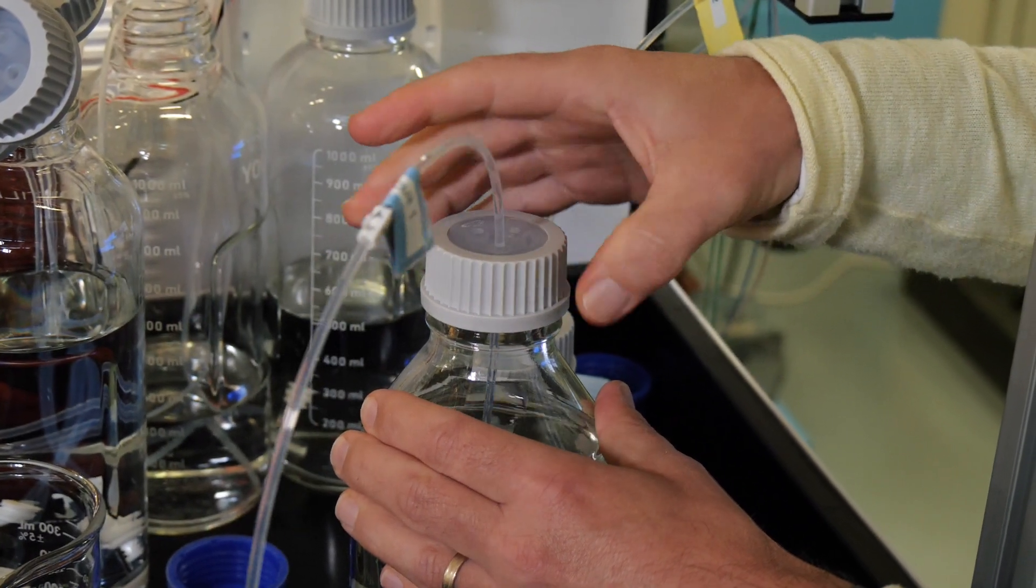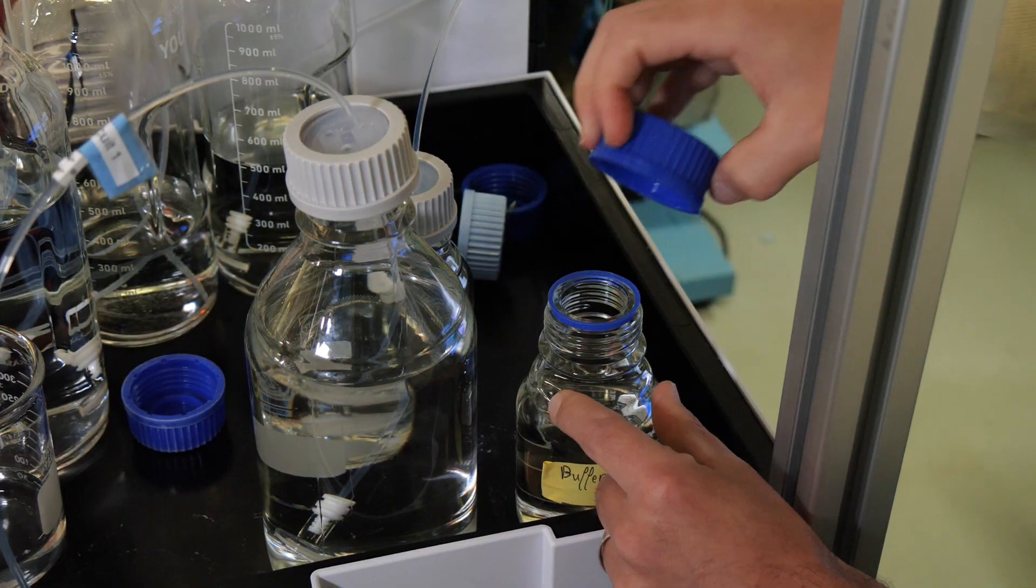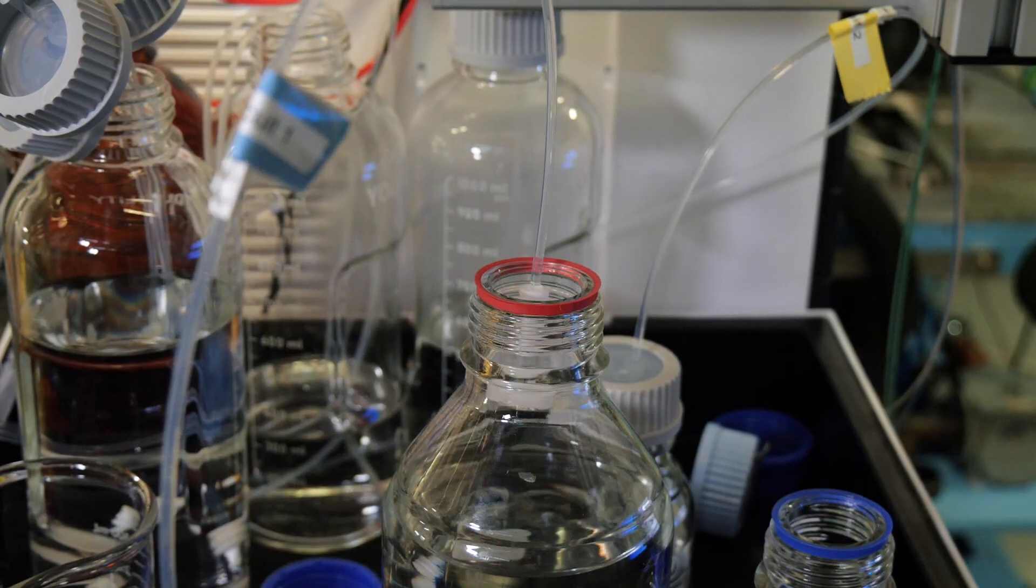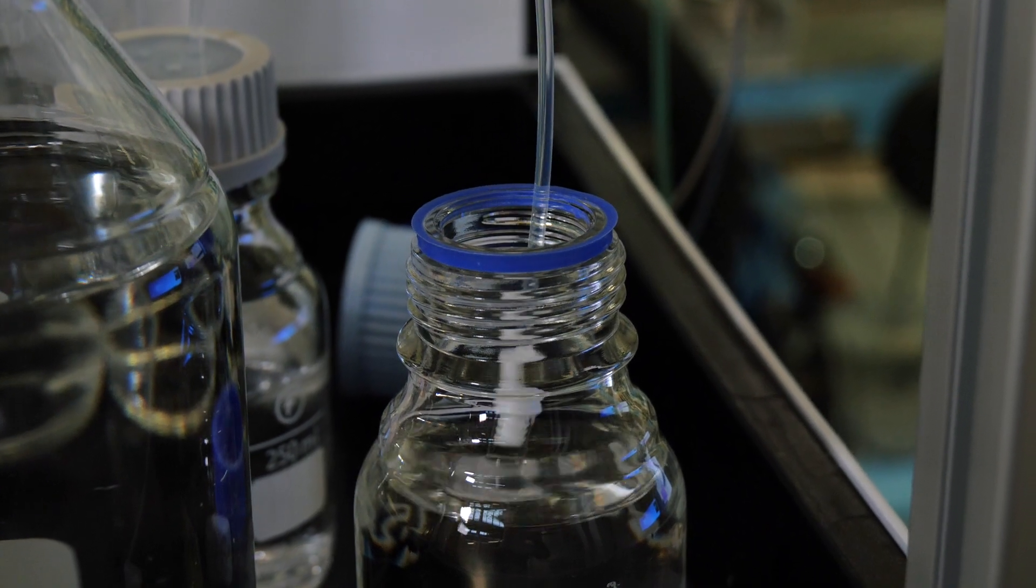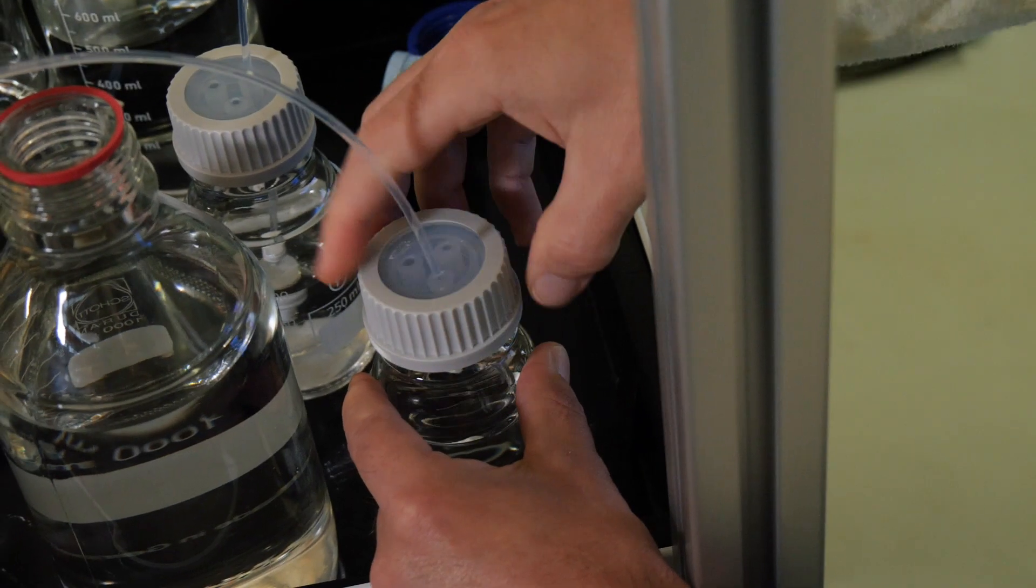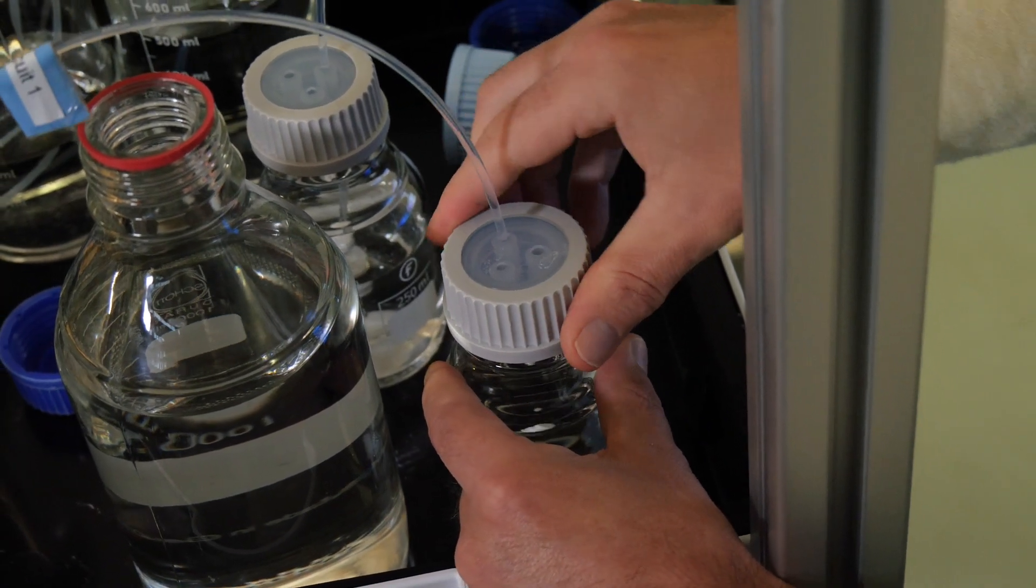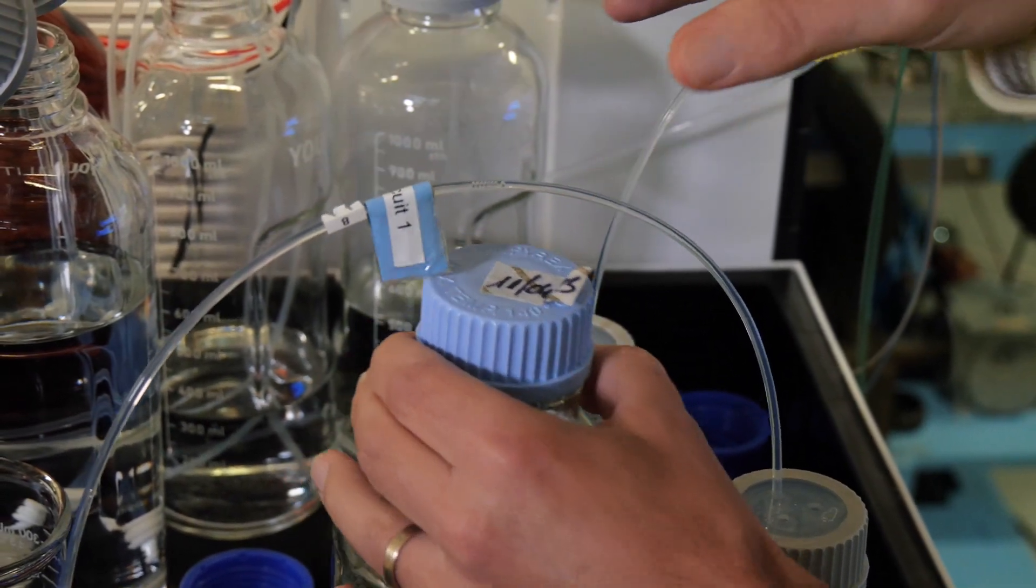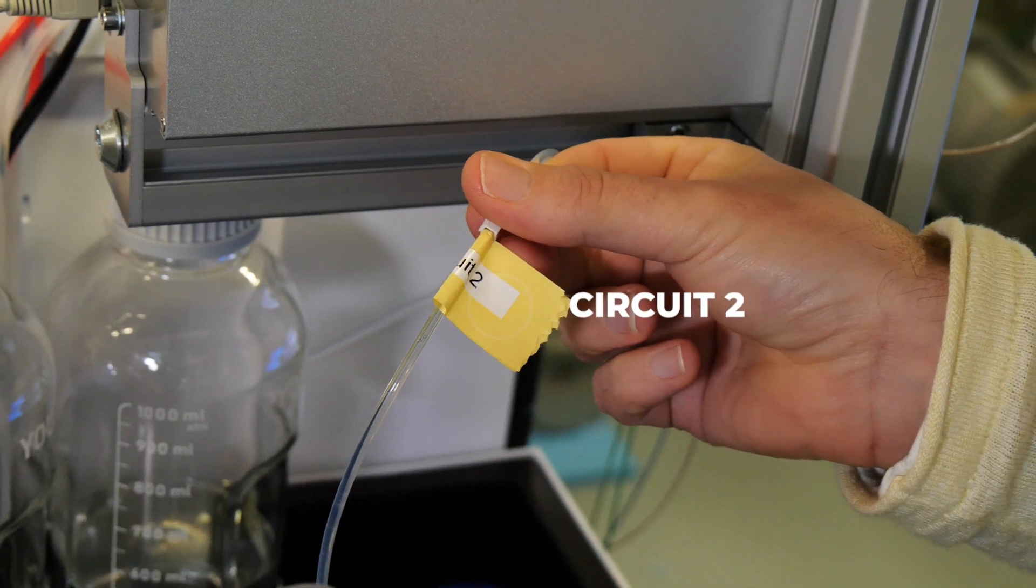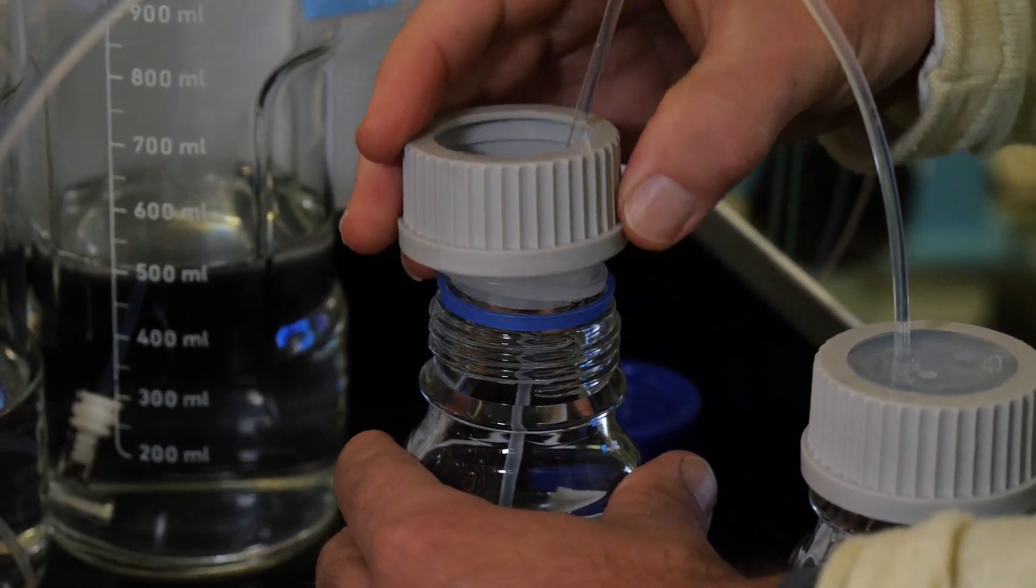If necessary, do the same for circuit two indicated with a yellow sticker.